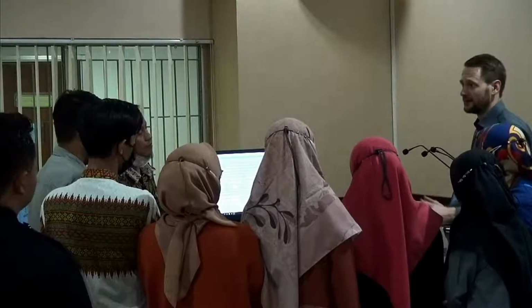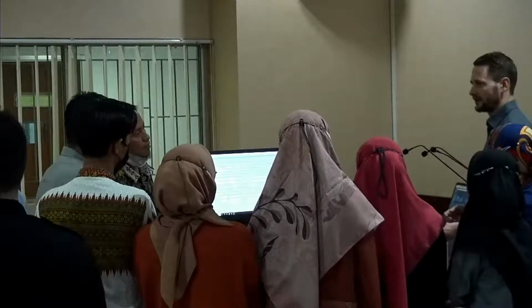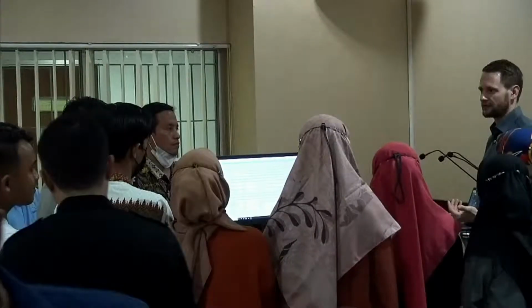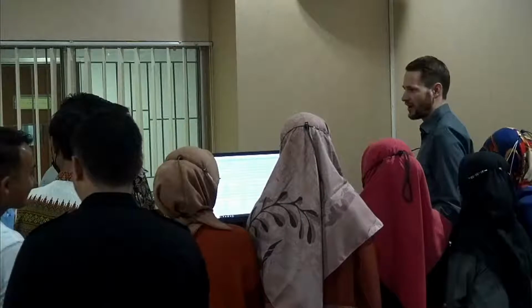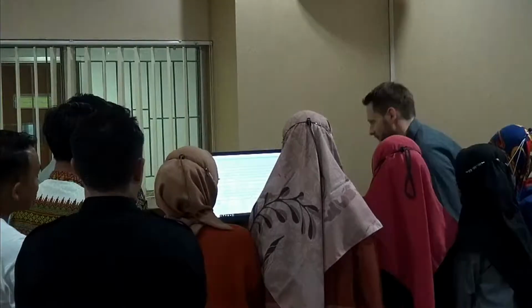Go on the internet, go to refractiveindex.info, see all the different universities in the world about refractive index. It's not that you just determine that like this. All the scientists in the world, you find different data depending on how you achieve it, theoretically, experimentally, and also this differs. So claiming you can determine it with a laser diffraction instrument just like that, sorry, no, you can't. And I think you have to be that honest to tell a person who's using this, you can approximate it. You can find a value that might work for your material, and then you can use that value, but you cannot determine that. That is absolutely not true.